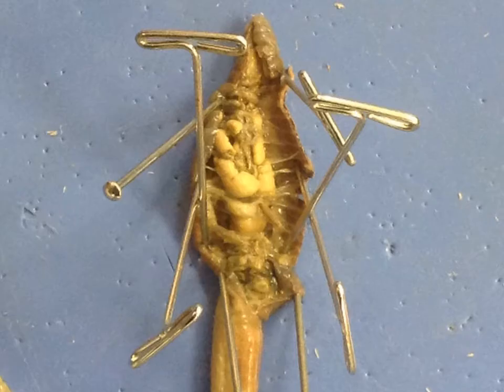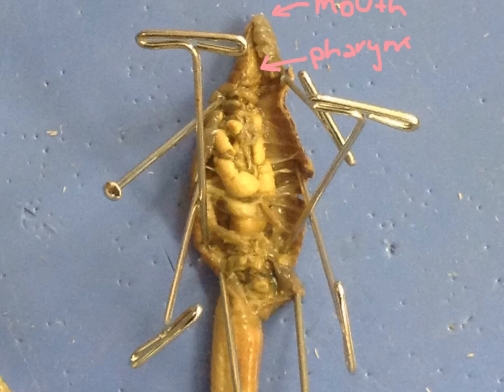Take a closer look, shall we? The next important part is the pharynx. The pharynx is located right near the mouth. That's the mouth. And this is the pharynx. The pharynx pumps food and soil into the esophagus. The esophagus is right here. The esophagus is the tube that leads the food to the crop, which will be explained later in the video.